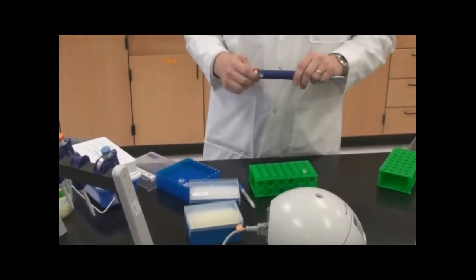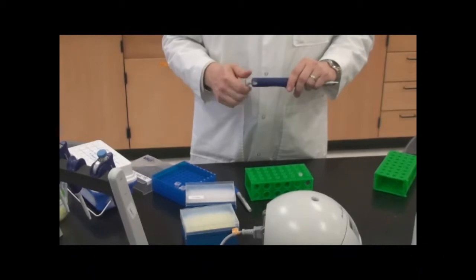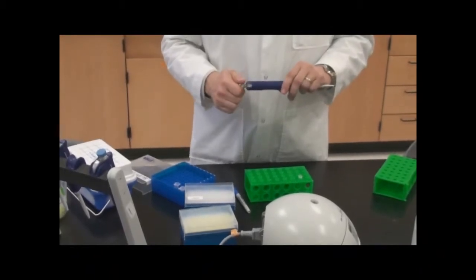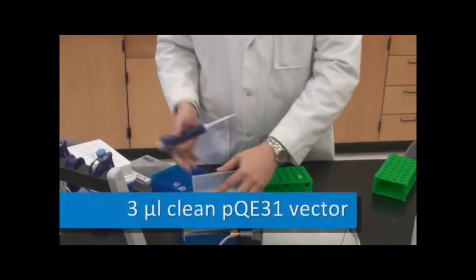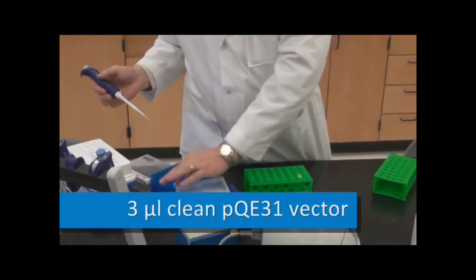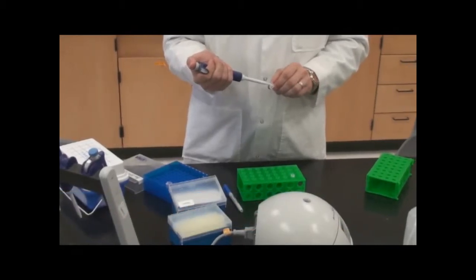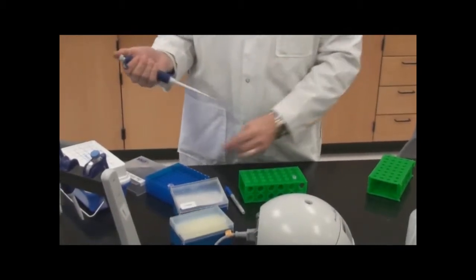So the recipe is in your manual, so I'm not going to go over that. I've got my one microliter of ligation reaction. I need three microliters of my clean PQE31 vector, and so I'm going to pull up three microliters.